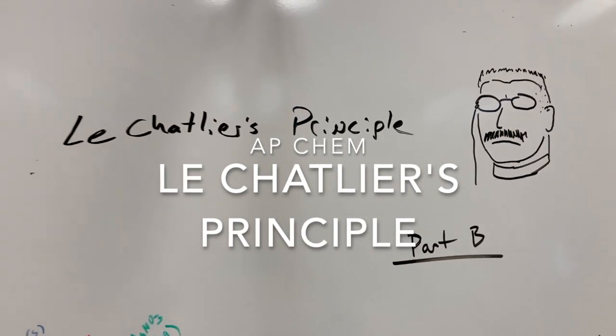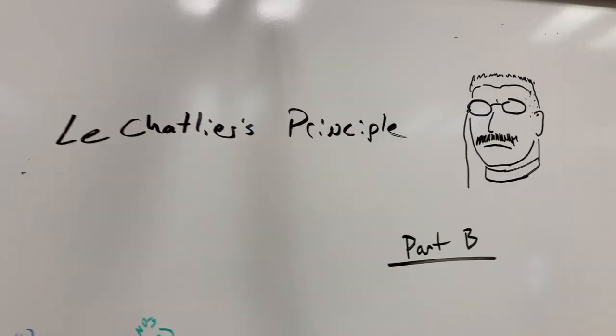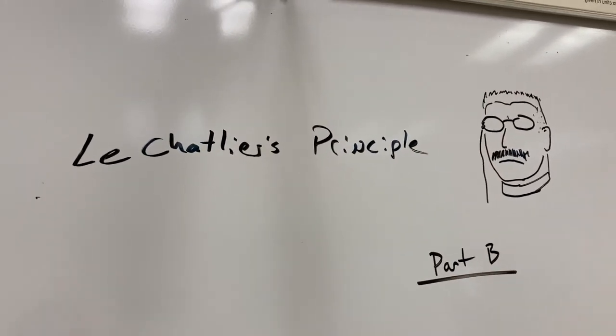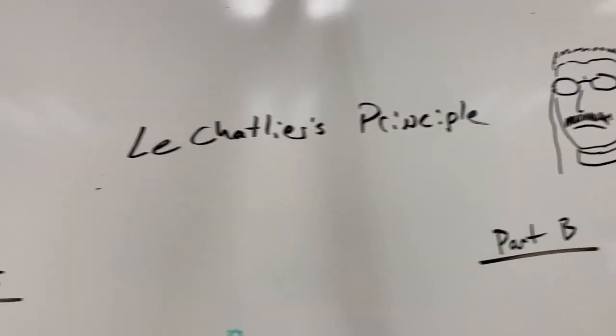So today's lab is on Le Chatelier's principle. And if you recall, Le Chatelier's principle states that whenever any equilibrium system is subjected to a stress, it is going to counteract that stress. So we have three parts to this lab.